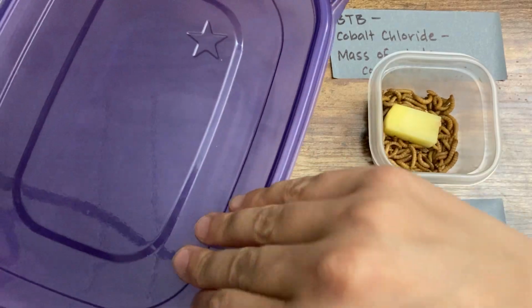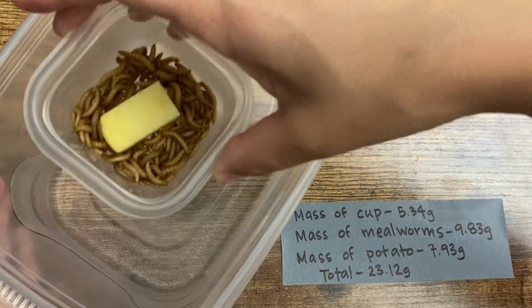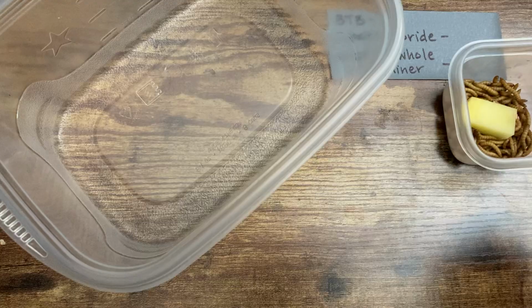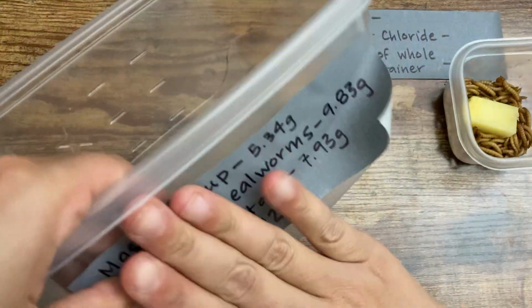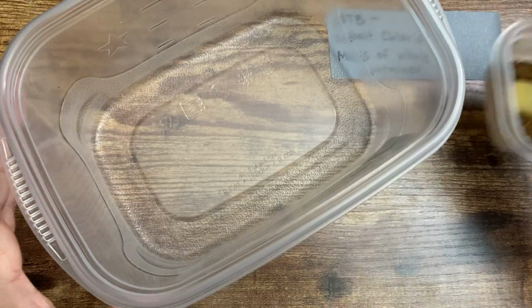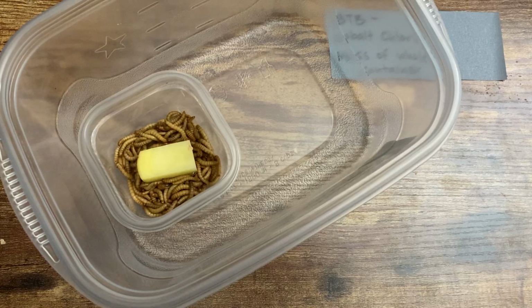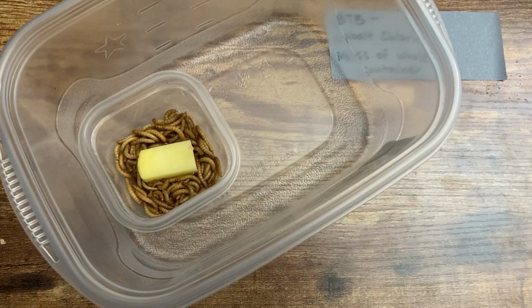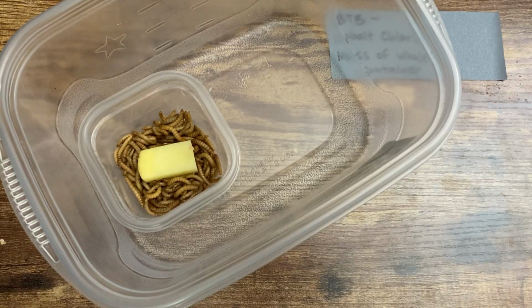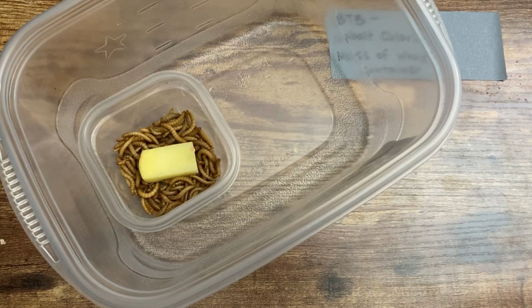All right, now that I have all of that data, I'm going to set this aside, and I'm going to put everything into this bigger container that can seal. So I'm gonna start, actually, let's put this tape on here first so I don't have to tip anything sideways. So I've put my data on the side of this container just so that I know which data goes with which container. I'm going to put my mealworm cup food situation in there, and then I need my indicators so that I can make sure that I know what is happening in this situation.